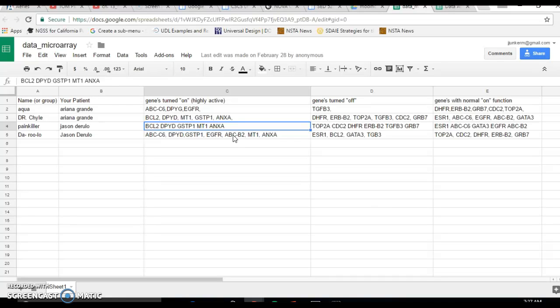This is a great opportunity potentially to redo the experiment using realistic results for data when you have conflicting information, right? You can use this as a teachable moment and to practice really good data collecting skills and to discuss potential false positives or falsely identifying a gene's activity level. That also can take time. Redoing a lab and allowing students to argue is helpful and develops skills for everyone, especially if you're doing the lab. It's great. You're engaging in scientific practices.